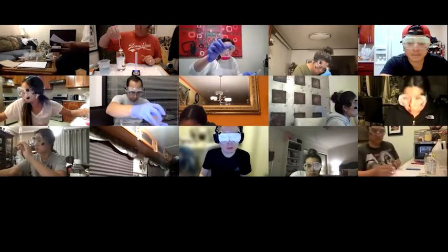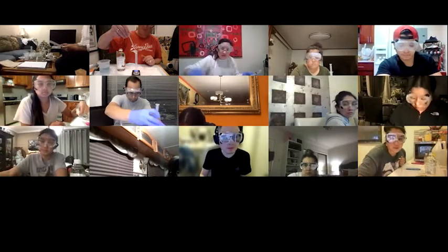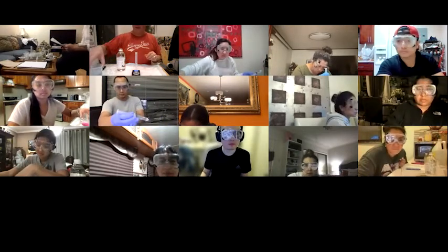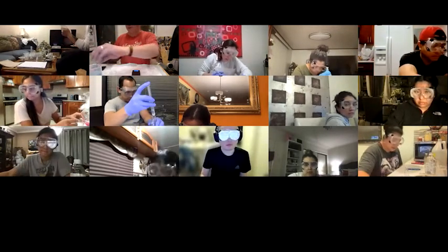Professor, the same thing happened with me. Just one drop and then it suddenly turned. It's too dark though, not the light pink. Yeah, that's what mine looked like. It's just one drop. I was like, oh no, I did this wrong. No. If it takes one drop, then that's what it takes. I want that light pink color though. It's pretty, right? It's a pretty color.